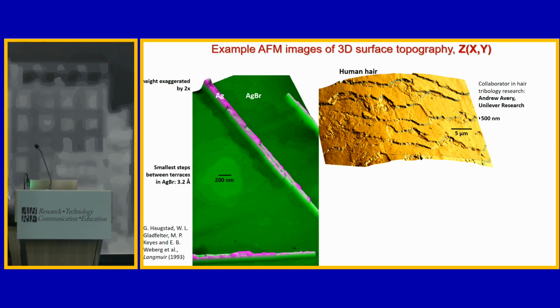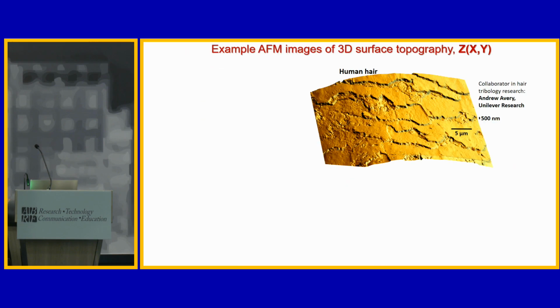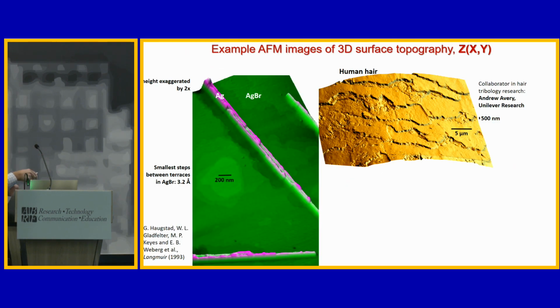You could also just go to a straight sort of color, and I should have said that in the last slide. The idea here is you've got a color gradient for Z that extends from sort of dark to bright through some range of colors, and that's how you're rendering Z. Here, my color gradient, if you look right here at the lowest spot, this kind of trench, up to the highest, goes from dark green to light green to sort of magenta or violet up to white. And this is about 100 nanometer change of height, but again, there's a 3D rendering along with the color that's going on here.